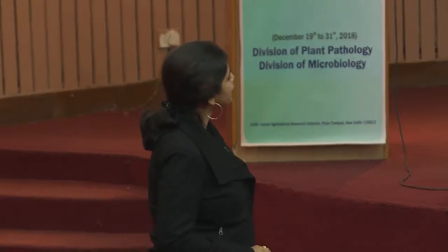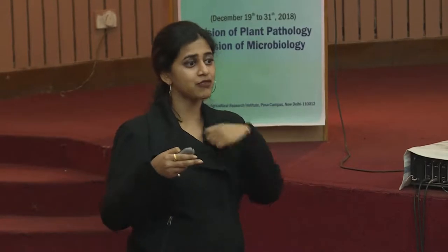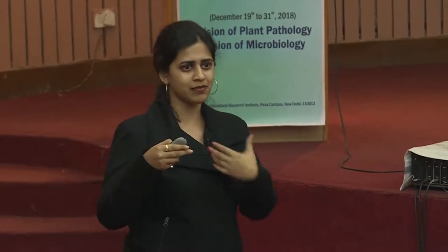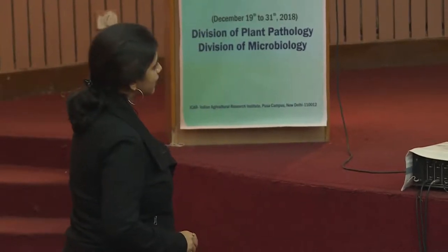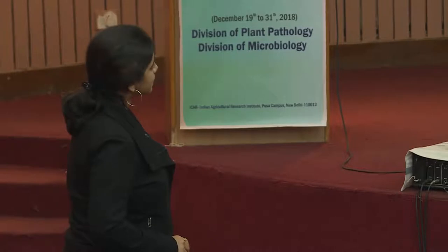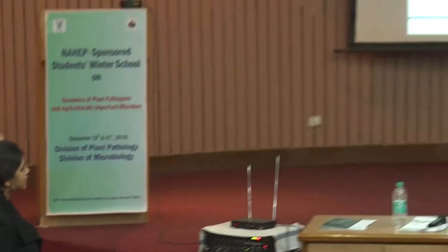So for example, we use overlapping, that is just the sequence matching being compared. Anywhere it finds an overlap of a certain number of bases that has been specified, when we are using an overlap-based algorithm, we specify I want 100 bases to be overlapped, or 50 bases, or 5 bases. Based on my requirement, I will say how many bases of overlap I require. This is how it will find the overlaps between the sequences. If I have raw reads, the raw reads will get an overlap like this. So nodes are my reads and edges are my overlaps.